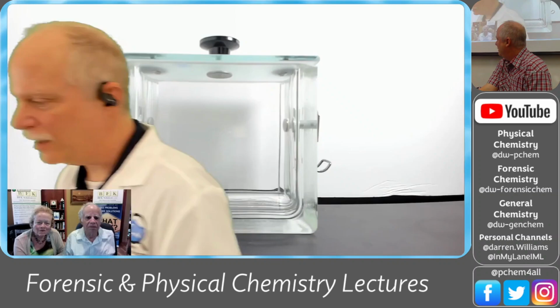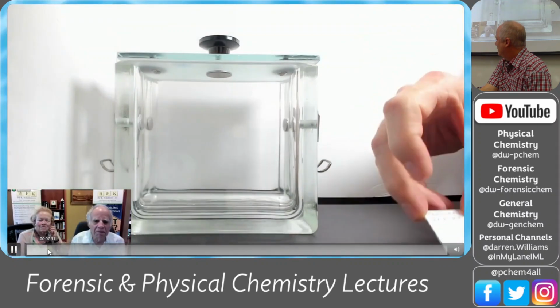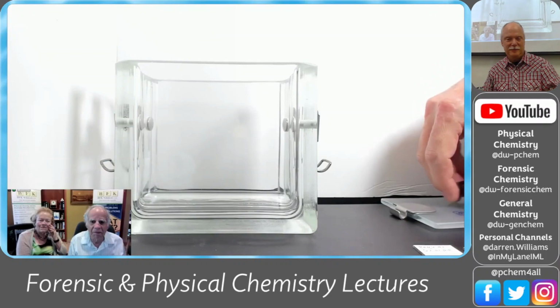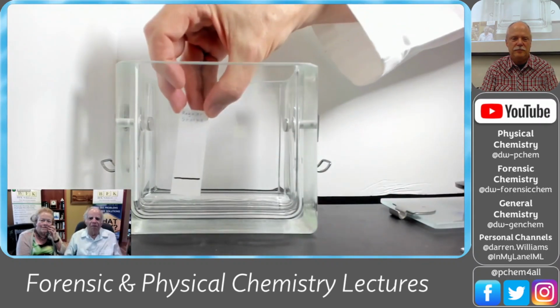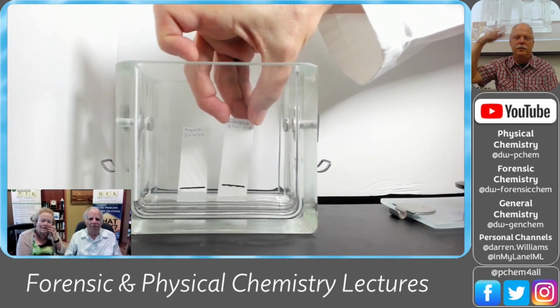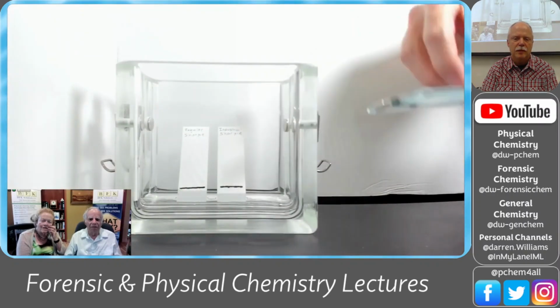Where's my mouse? There. Thin layer chromatography slide. And here we have industrial Sharpie. Okay, I'm not going to touch it. And we have an elution chamber filled with ethanol. Well, it's just got a pool of ethanol in the bottom. We're going to put that in there. So we did a line. We're just going to run this experiment the whole time while we talk, and you guys can watch it happen in real time.